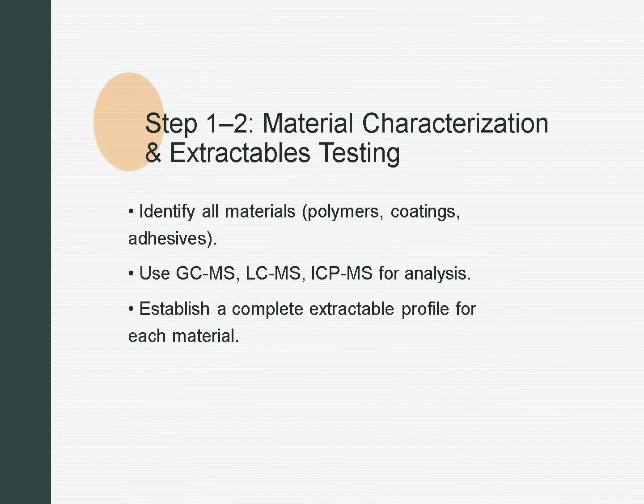First, we start by understanding the materials that make up the device, the polymers, coatings, adhesives, even colorants. Each component tells a story about potential risks.